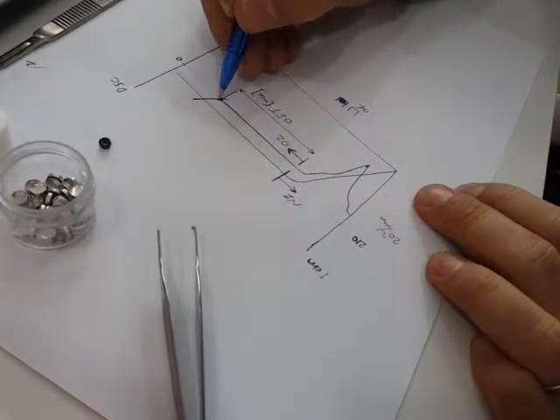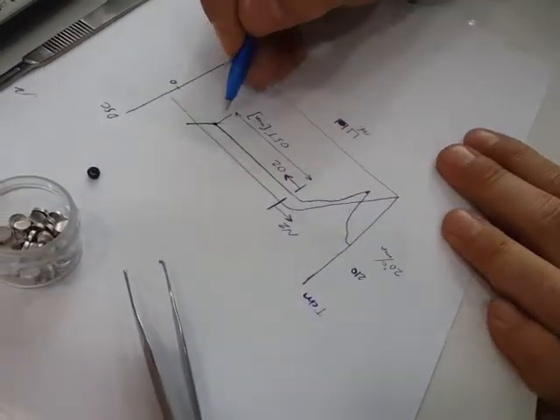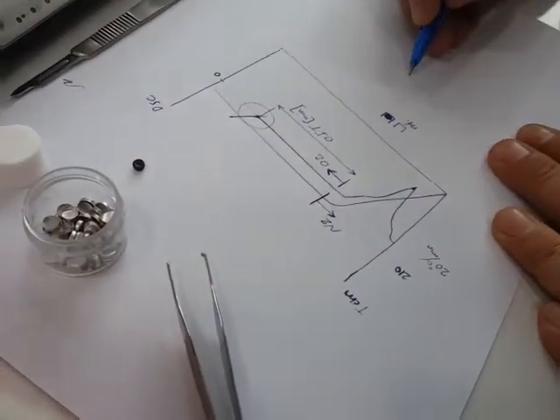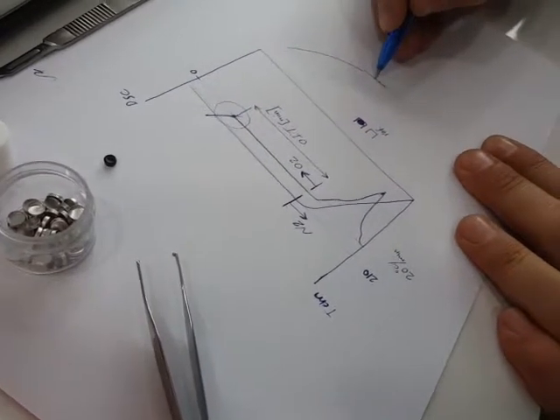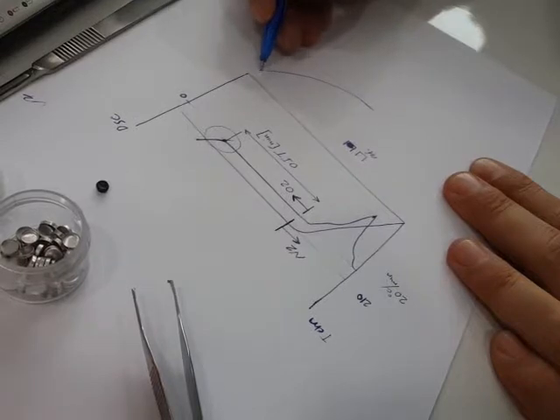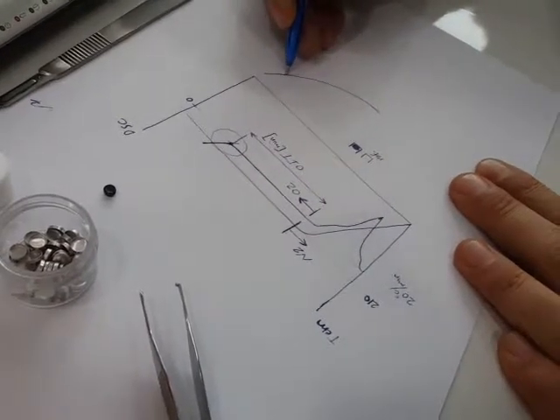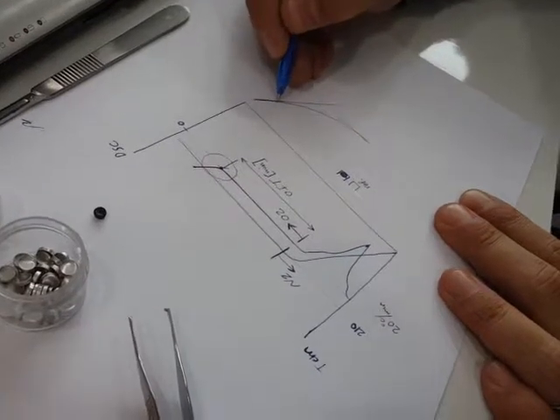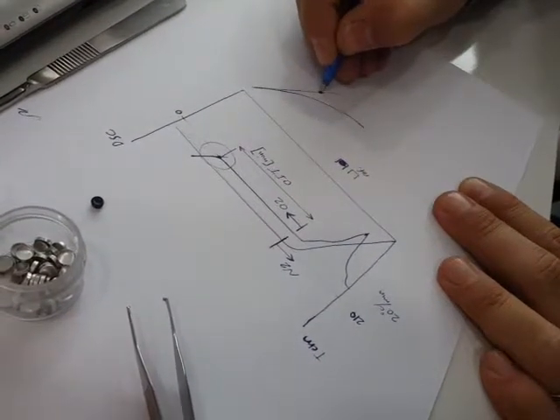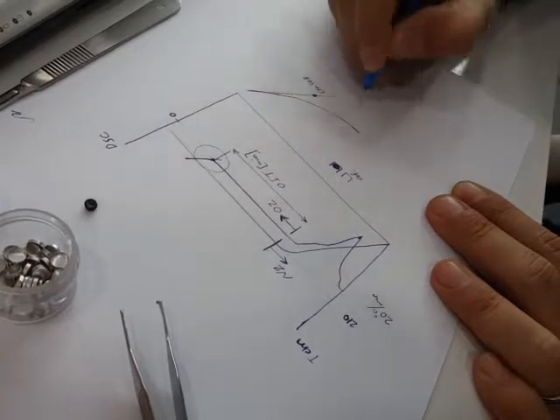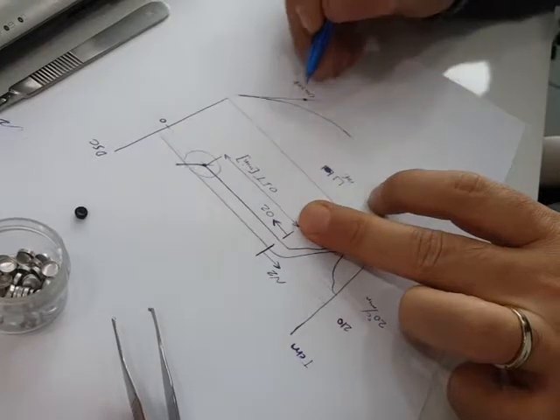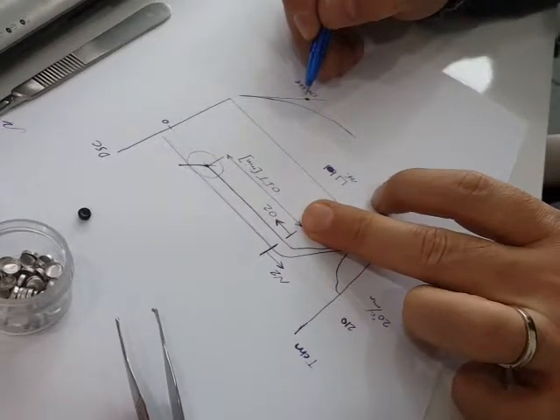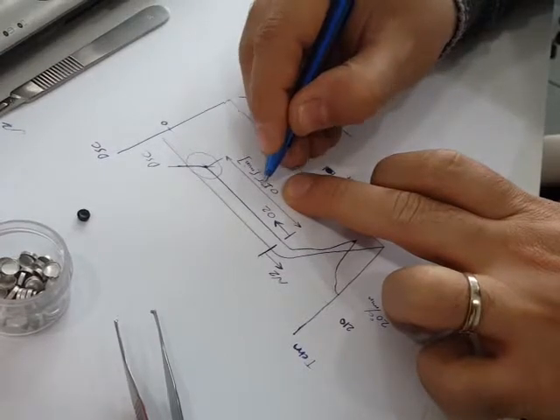You see the onset temperature - I'm just magnifying the section. It's something like this: this is a baseline, this is a tangent line of the break of the graph DSC graph, this is the onset point. From the starting of the oxygen to the onset section of the DSC graph is the OIT value.